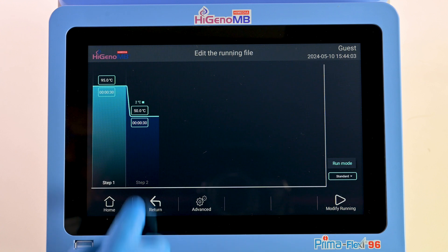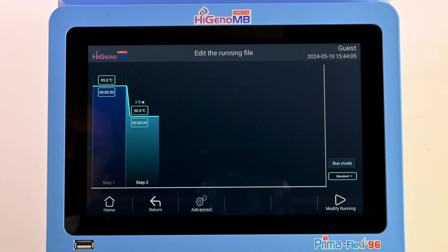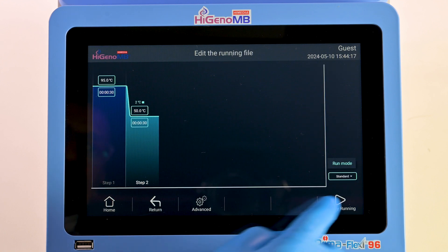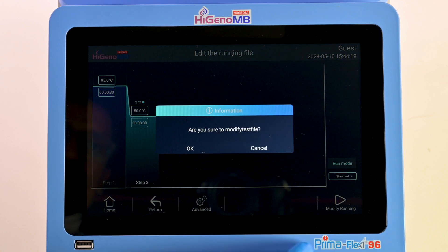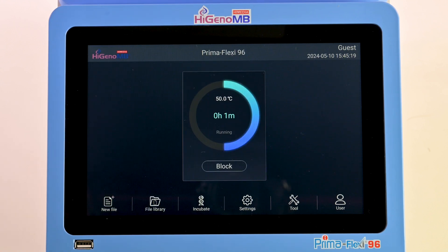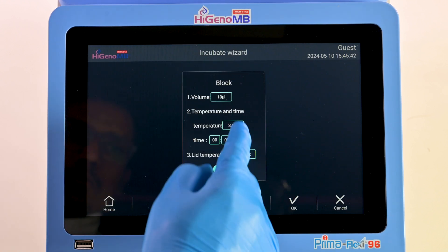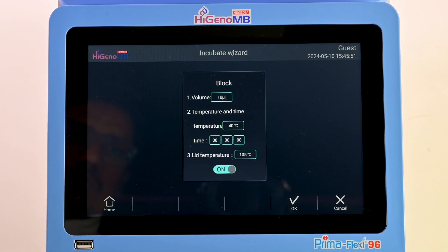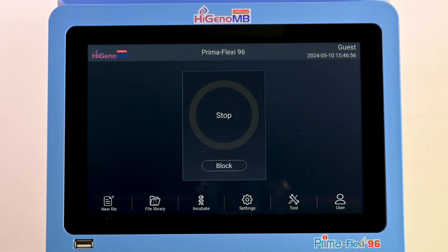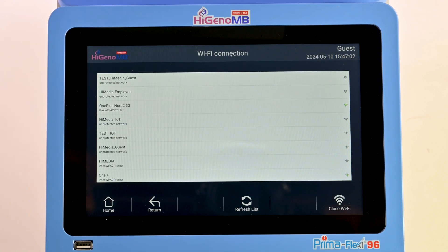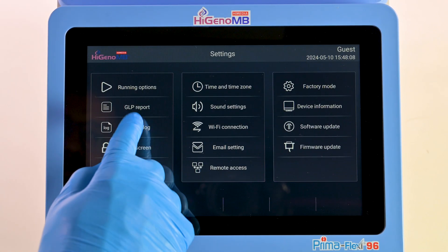Click on Advanced — the user can edit the gradient temperature, increment, extent, and ramp rate. Users can switch between run modes: Standard and Fast. Click Modify Running, then click OK. Users can view the runtime and temperature. The system also has an incubation facility — click on Incubate. Click on Settings to access multiple options such as Wi-Fi connection, email settings, and system log.